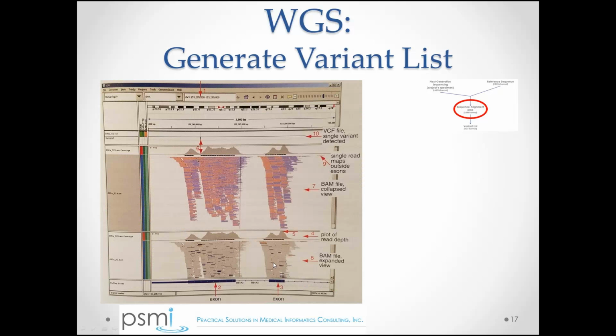And so there were fragments, DNA read fragments, just corresponding to the exons of a particular gene. And so what you'll see here is that there's a tremendous number of reads overlapping the exons and almost no reads overlapping the introns. And that was the way that this particular experiment was designed.